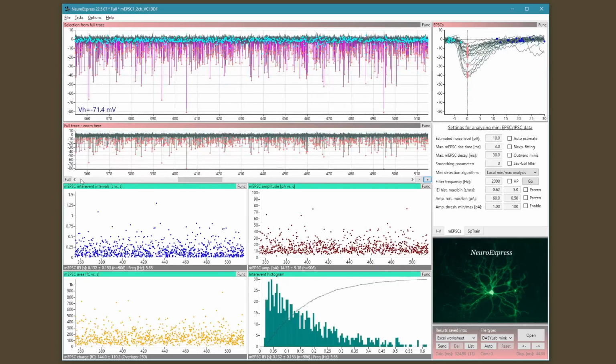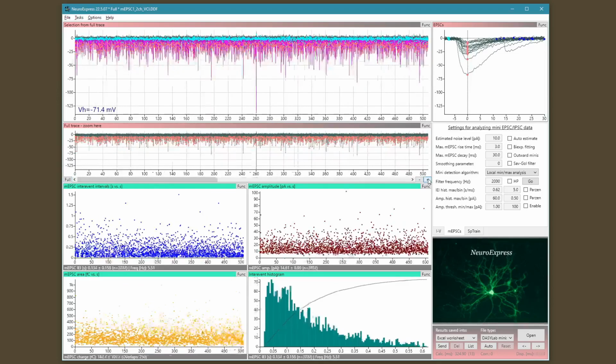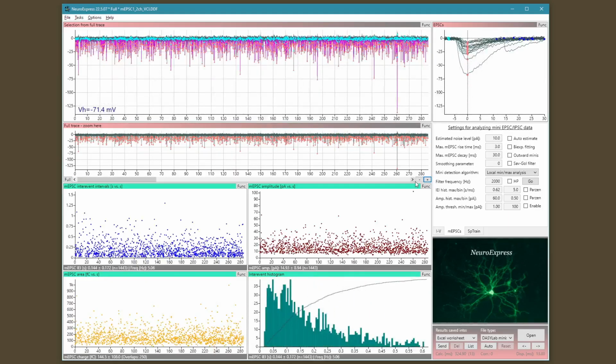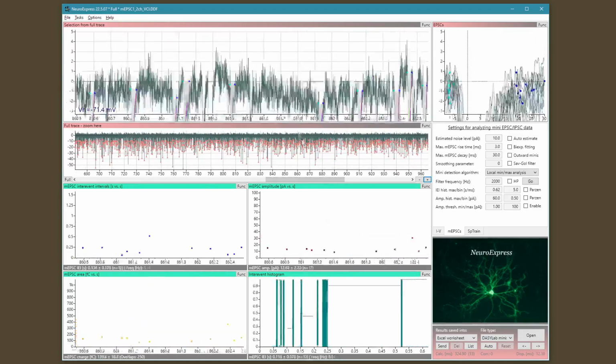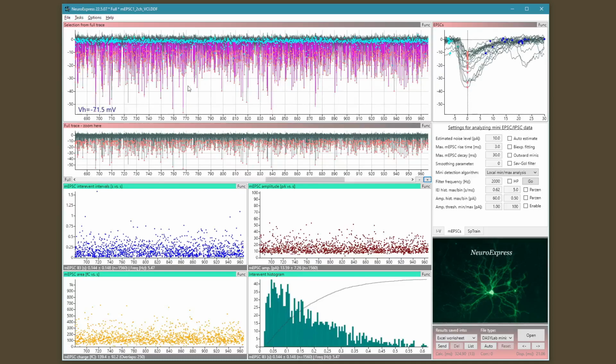Then you can go back here, or you can also click on the full button to show the entire recording like here. So this is basically how we navigate through our recording, and we can see very tiny details or the entire recording as we like. So the display is fast, and also only the selected part will be shown on the top panel. So the title here says selection from full trace, and in this case the selection is within the zoom window, but if I unzoom, then the middle and the top panels will show exactly the same current samples.